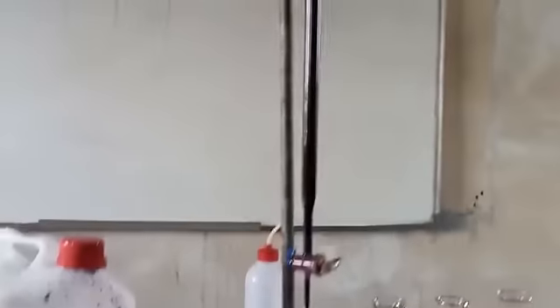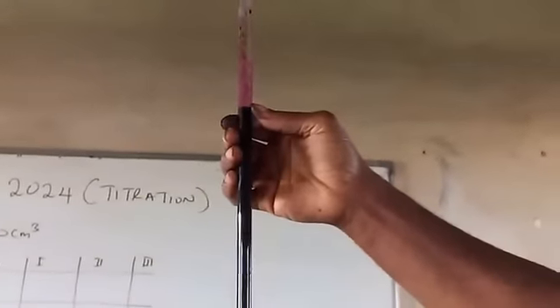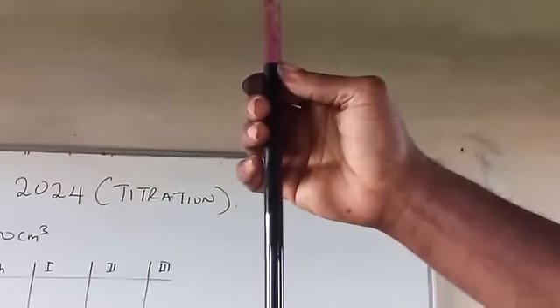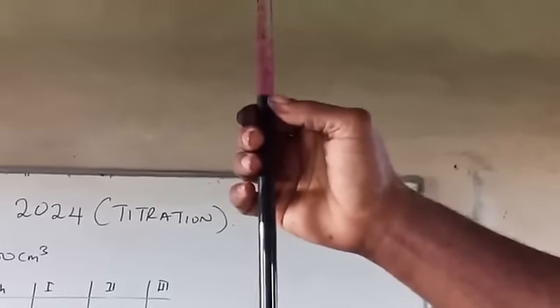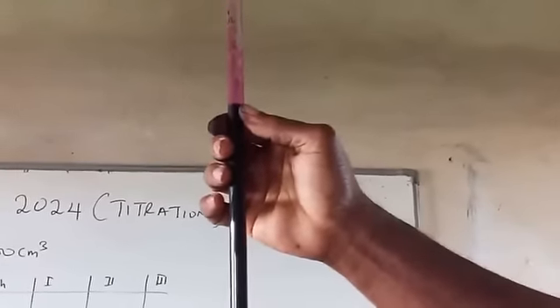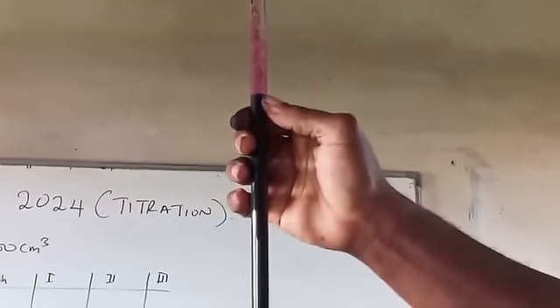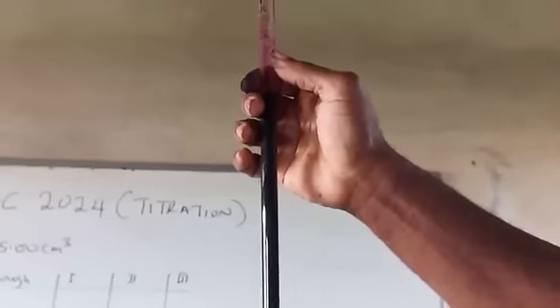So let's go up. This is 3.1, 3.2, around 3.30. Now we start from 0 and the color change around 3 is a quick endpoint. 0 to 3.30. So the final read is 3.30. Initial is 0.00. These are rough.